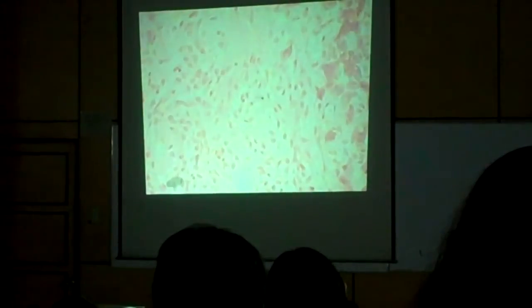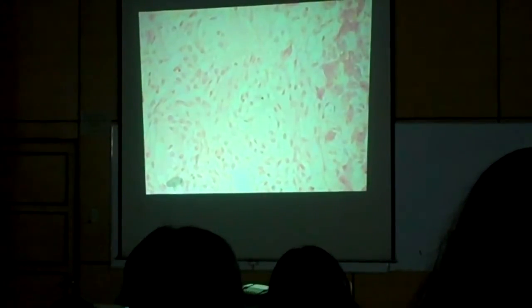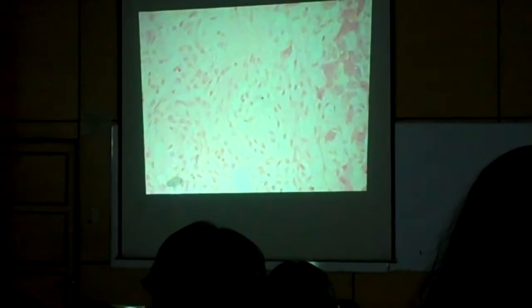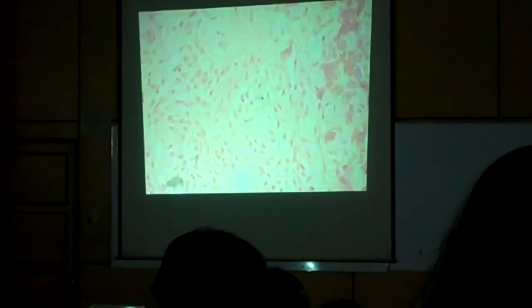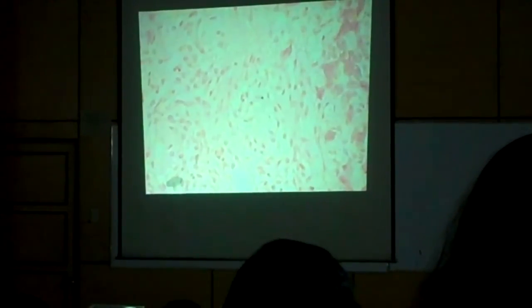Okay, we would not consider it if you answer lactotroph, somatotroph, corticotroph. Although maybe if it is pointed on an acidophil, you answer somatotroph. I don't know. It depends on the consensus of the department, if it will give you a point or a half point, since a somatotroph is also an acidophil. But again, how do you know that it is somatotroph?